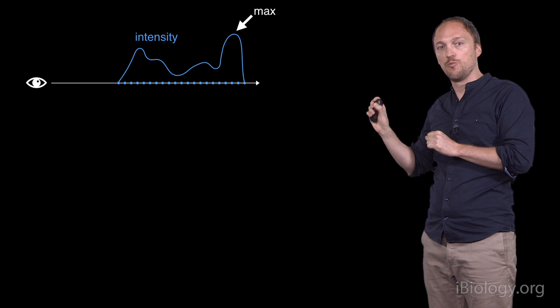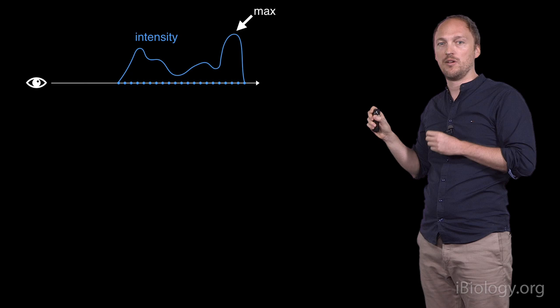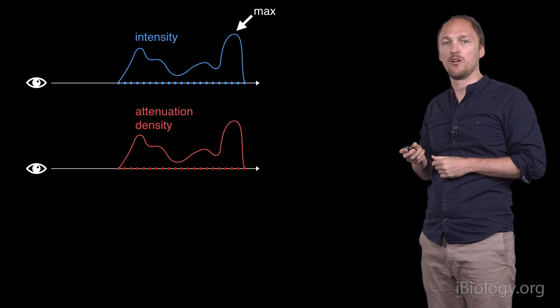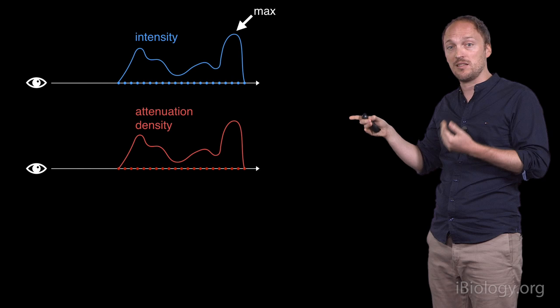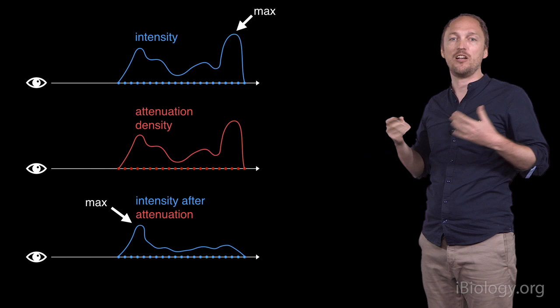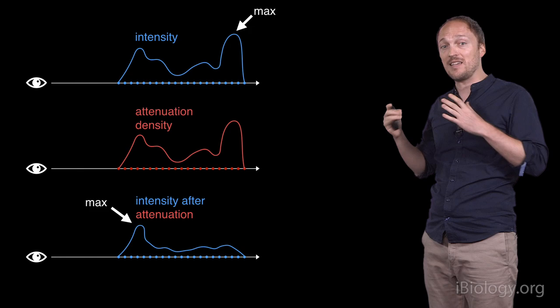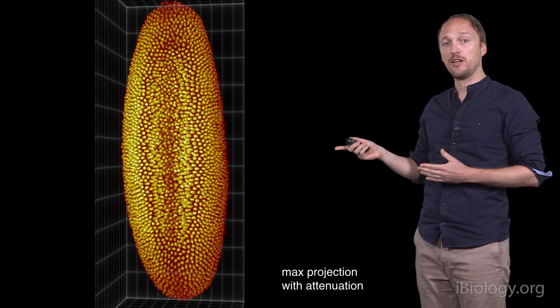Let's consider an example. Here, the maximal projection would return a value coming from the back of the visualized sample, despite the fact that there's a lot of structure to show at the front of it. One simple solution is to model the attenuation as proportional to the signal itself. Now, intensity values are attenuated as they traverse the sample. The maximal voxel value is not at the back of the sample anymore, but at the front, because there's less attenuation for structures at the front than at the back.